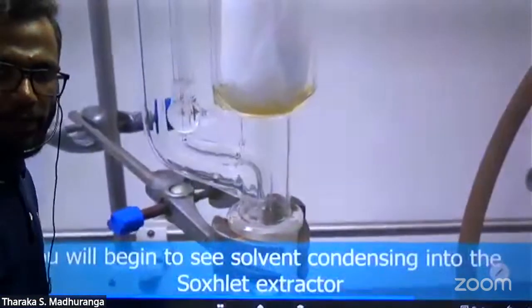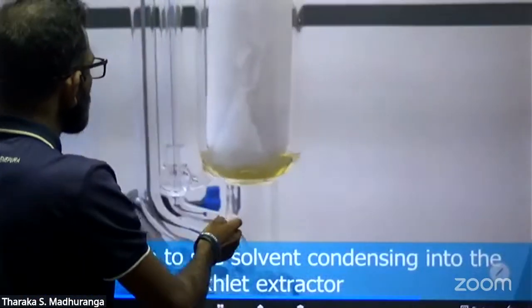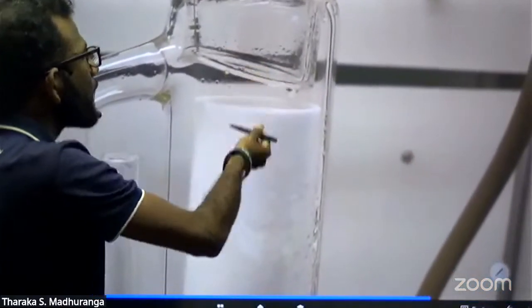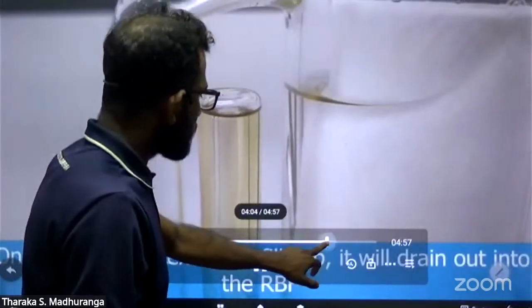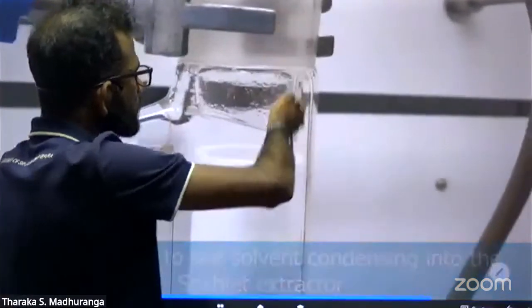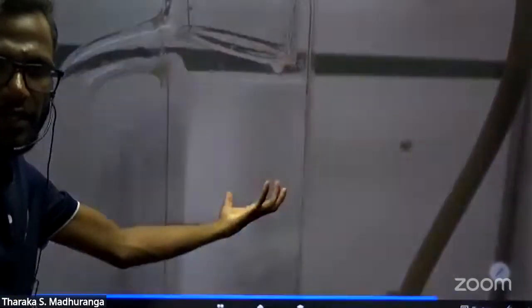Then the solvent starts to vaporize, and the solvent goes through the solvent carrying line, comes to this chamber and goes through the condenser. Then after going through the condenser, you can see these liquids come down. Again this liquid comes to the plant material chamber.